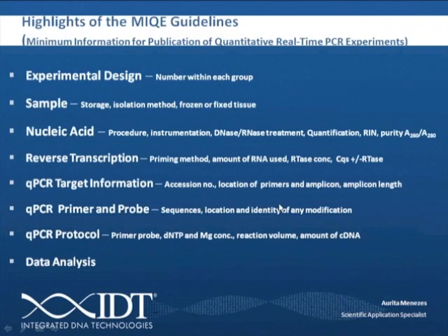These are some of the highlights of the MIQE guidelines. I'm not going to reiterate them. You can look at it later when it's available for viewing. I would like to point out that for publication, sequences of the primer and probe are essential, as well as location and identity of any modification.